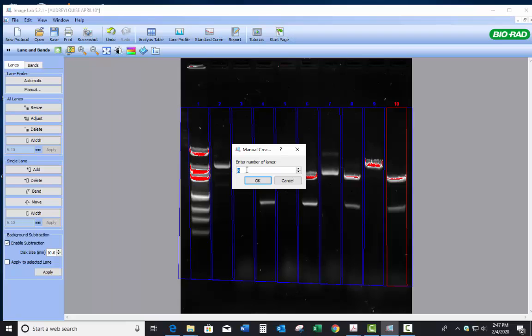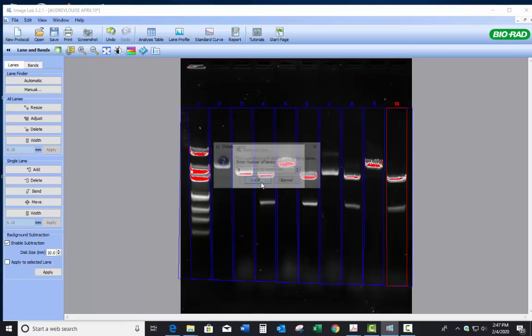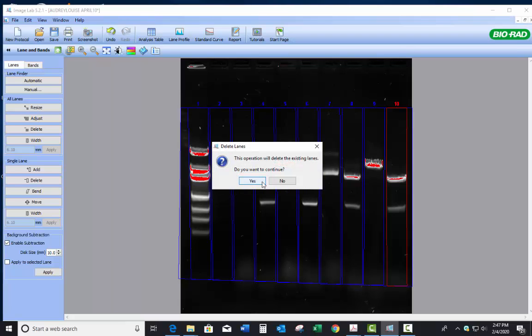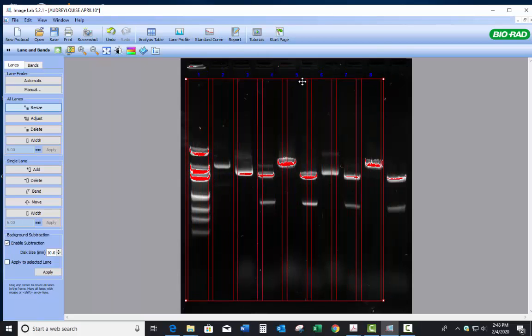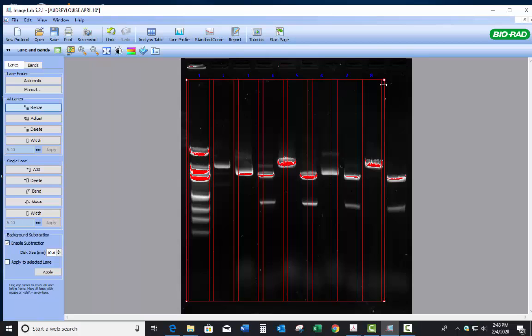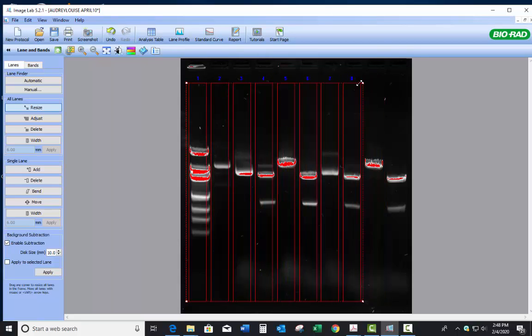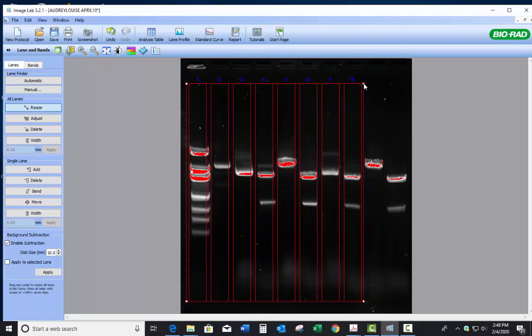Or you can do manual lanes. So for example, enter a number of lanes. For example, you've got eight. If we hit OK and delete existing lanes, yes. So now there's eight, but of course there's more lanes than that on this gel, so I'm just kind of showing you how you can manipulate that. So right there, that is a bona fide 1, 2, 3, 4, 5, 6, 7, 8. So that's eight lanes.